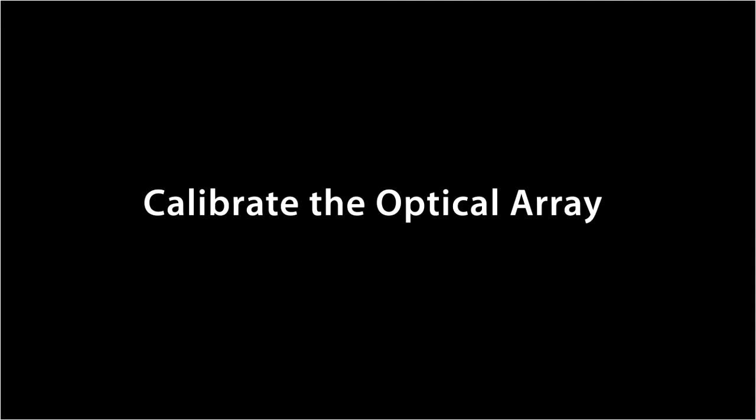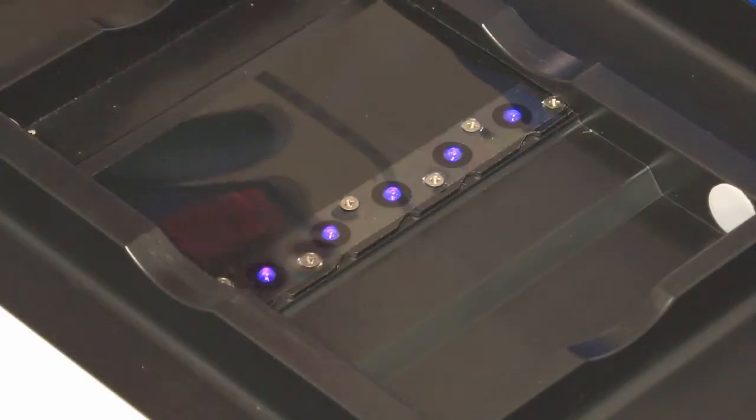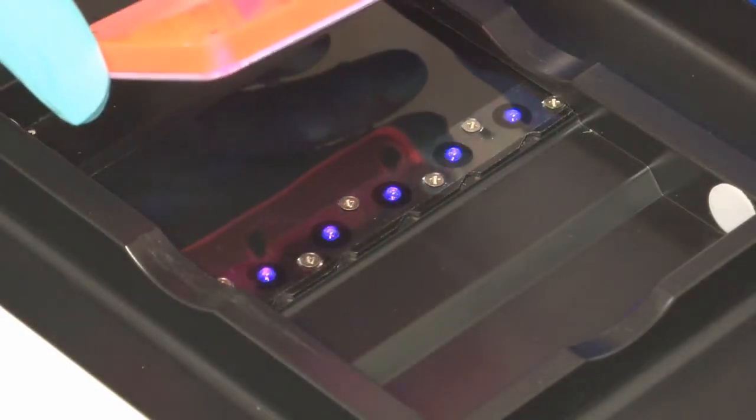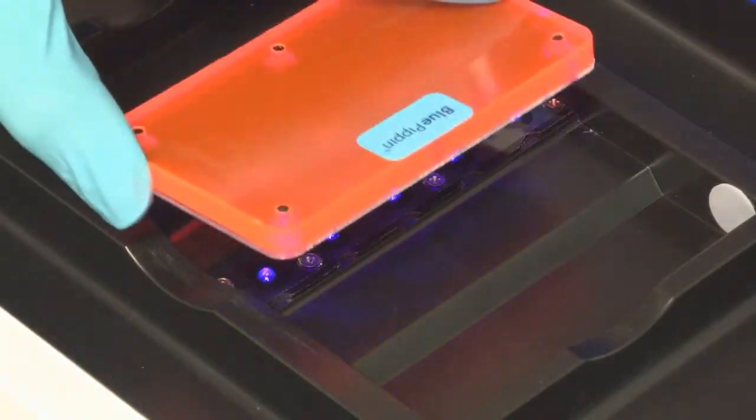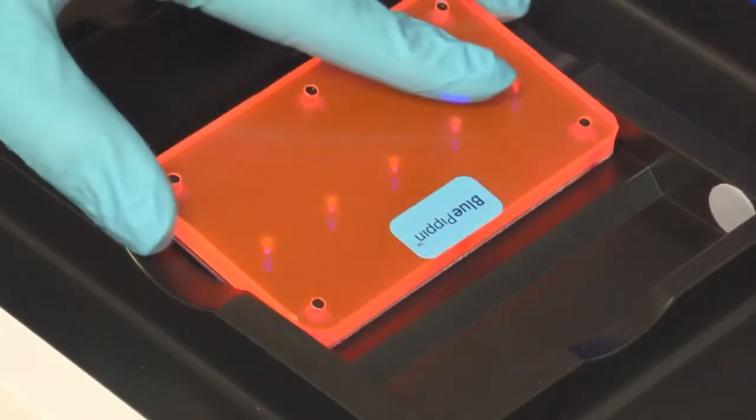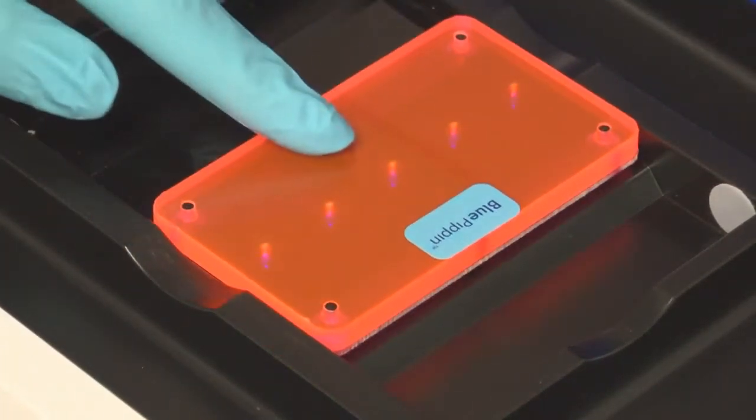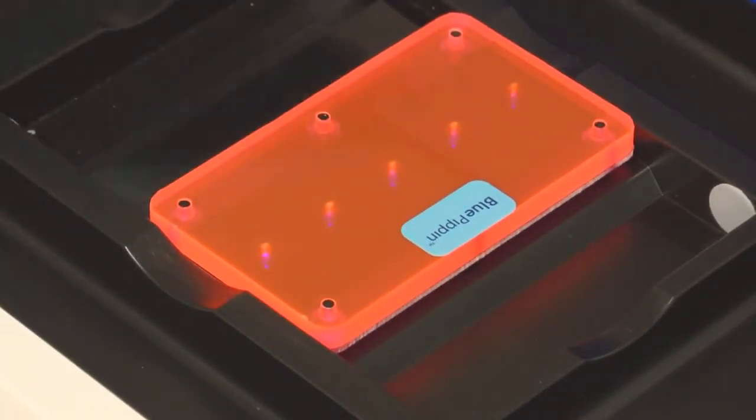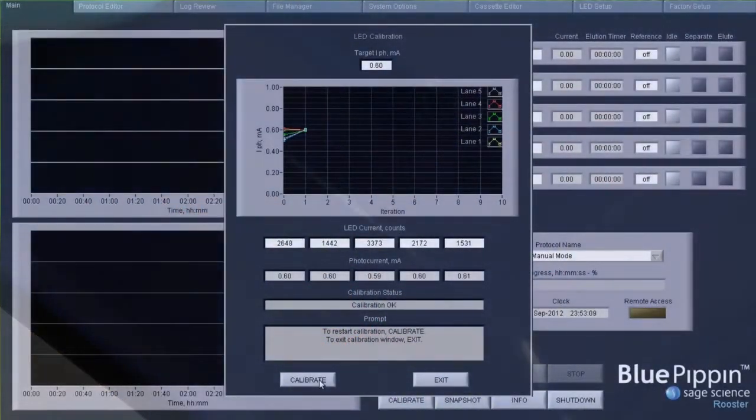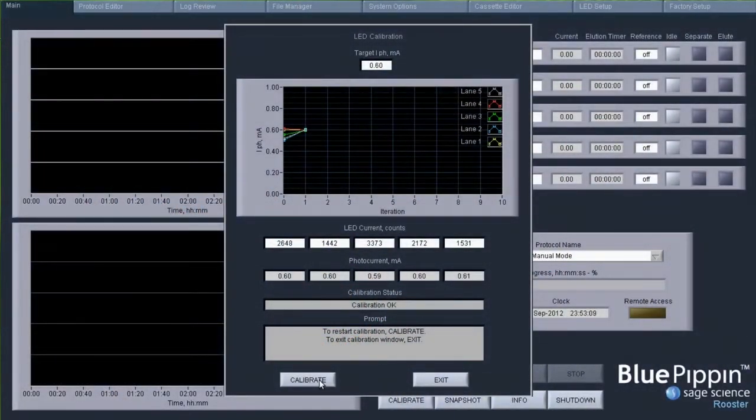The next step is to calibrate the optical array before running a cassette to ensure that the LED detectors are operating at the correct intensity using the calibration fixture in a short software algorithm.